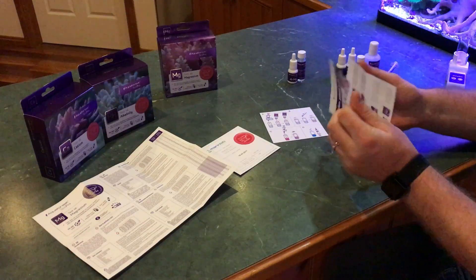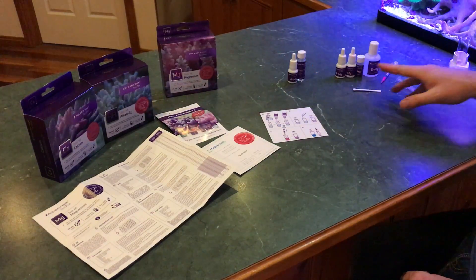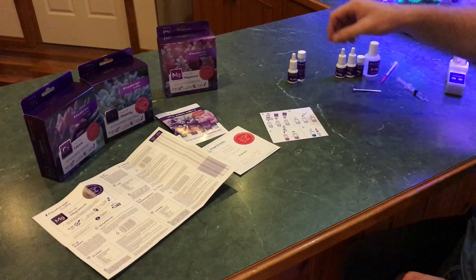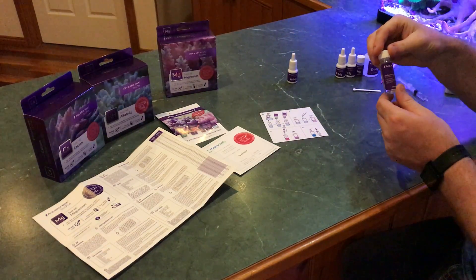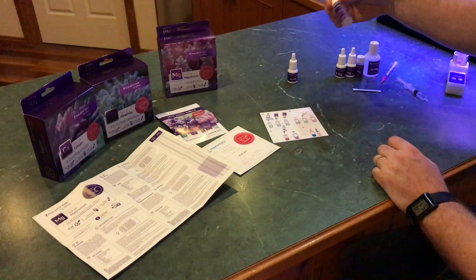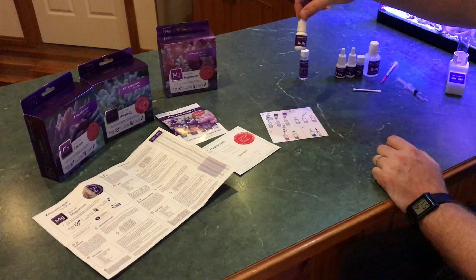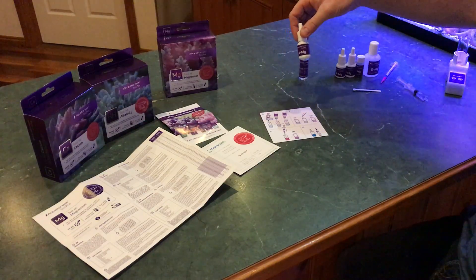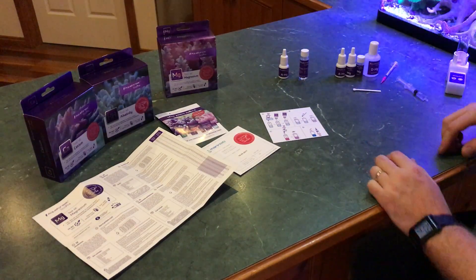You get a little bit of promotional material which fills out the box. You get all of these reagents, which is pretty cool. These two I won't be using today — that's the reference solution which does calcium, magnesium, and salinity. That's pretty sweet because I've seen other brands sell that as an extra fairly expensively. You also get two of the A reagent, which means you can keep one sealed a bit longer.